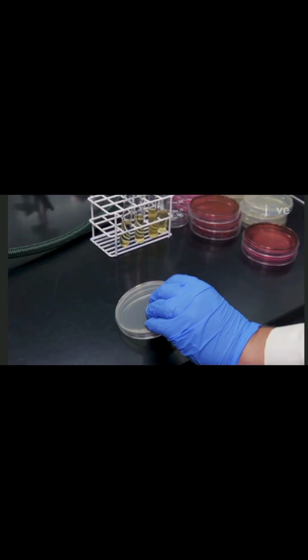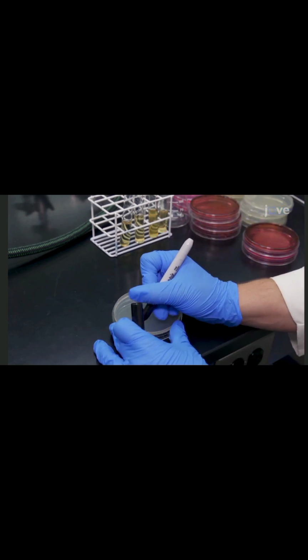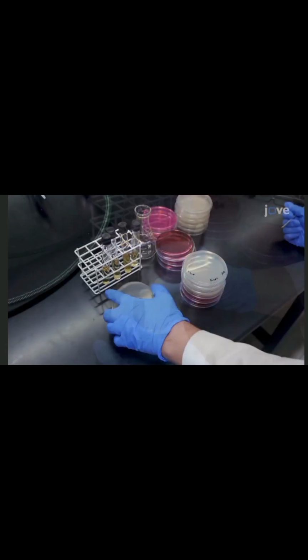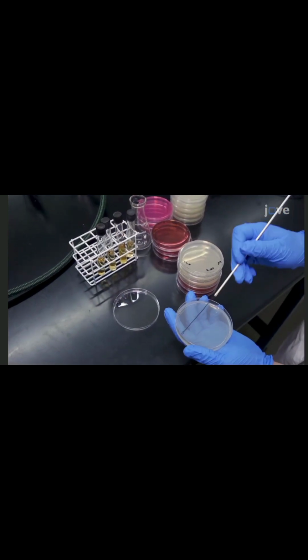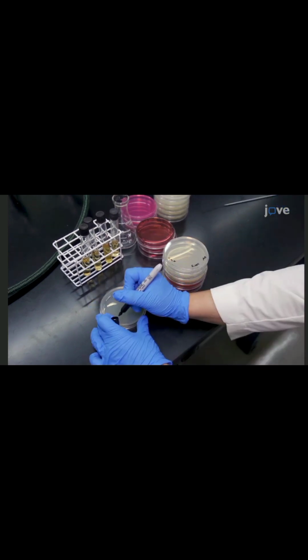Now replace the lid and label the bottom of the plate with the name of the bacteria, media type, date, and your initials. Then repeat the streak plating using the same bacterial culture for each of the remaining 3 plates, taking care to label them each time.